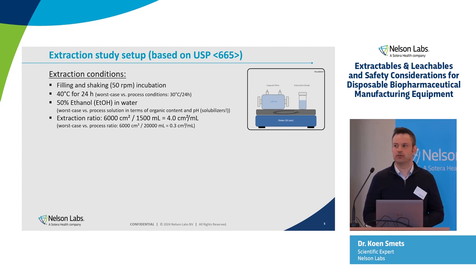So taking into account that information, we designed the following study, and it was mainly based on USP 665 because it was a moderate risk component. Extraction was performed using filling and shaking incubation, and we selected the short-term contact conditions of both testing protocols, being 40 degrees Celsius, 24 hours. And when we compare them to the actual process conditions, you can see that they are definitely worst case.